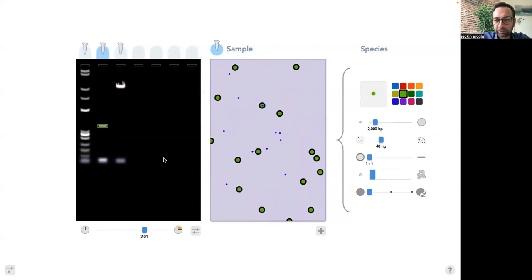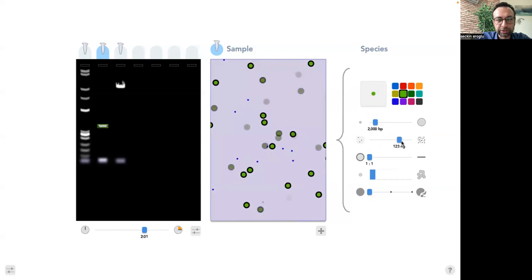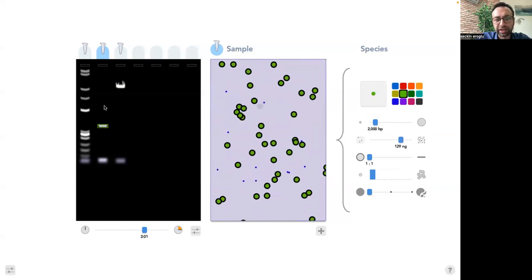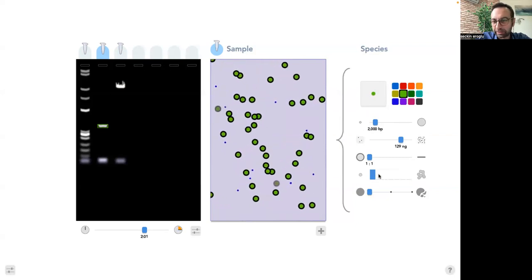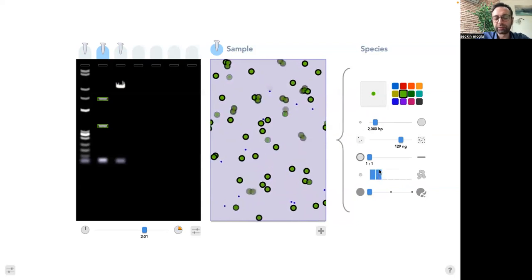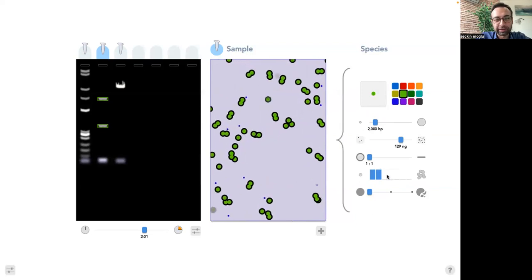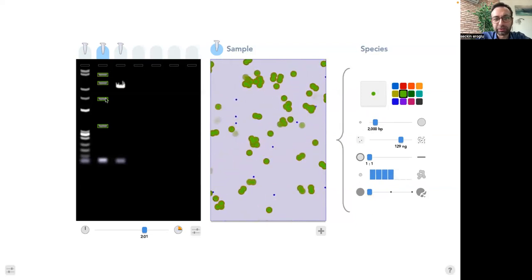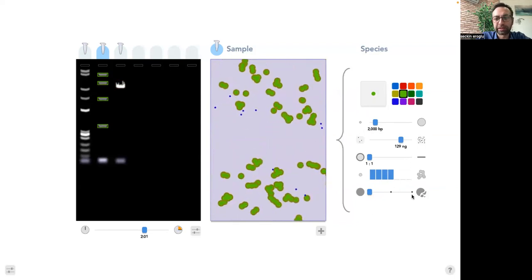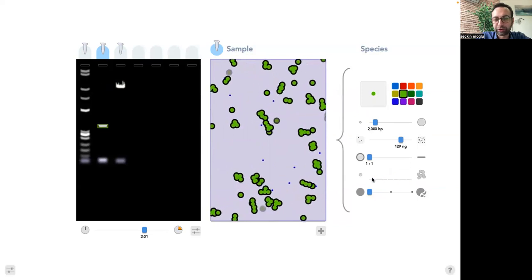Okay, what else is interesting is sometimes, especially when the concentration is high, you start to see a band with a higher molecular weight. This usually happens if there's aggregation. So if your DNA aggregates with each other, for some reason again, you will have other bands. Usually it's not the case, and if it is the case, you don't have that strong band. But it can happen.